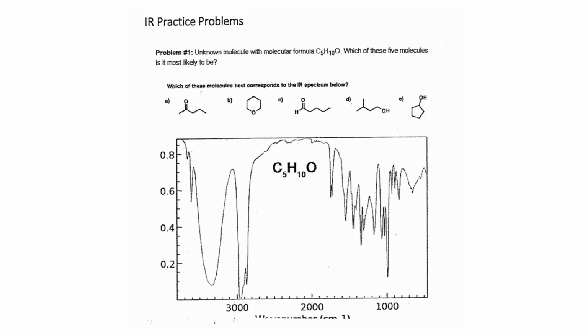Now let's start solving problems given that. So we have this molecule. This is a C5H10O. And for this HDI, that's the first step you always do, is 1/2. So 2 times the number of carbons, that's 10, plus 2, minus 10. Oxygen does not count. So that is 2 divided by 2 is 1 unsaturation. Remember that that 1 unsaturation could be a pi bond or a ring.